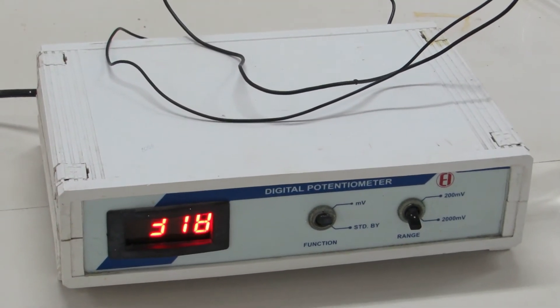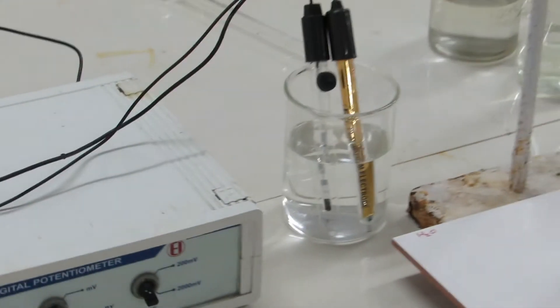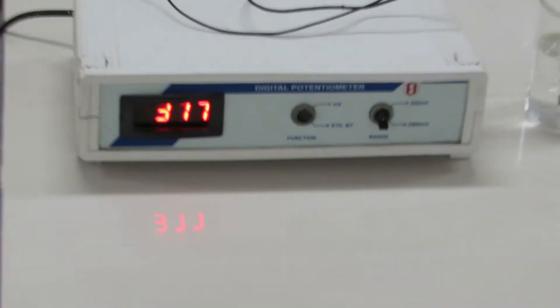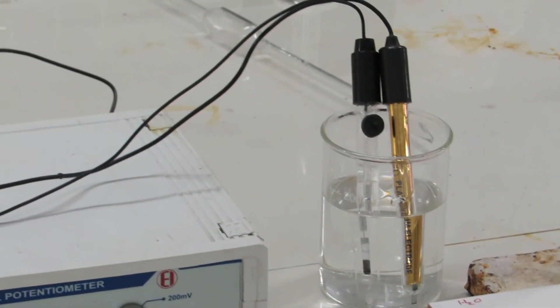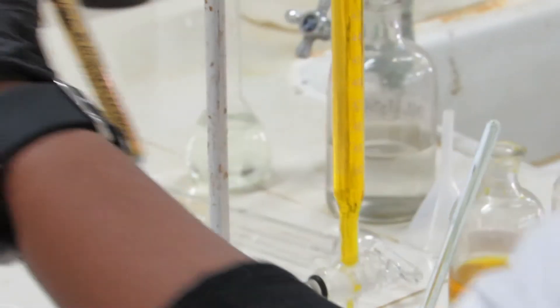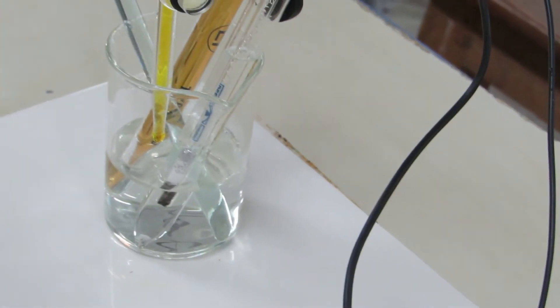Now the prepared iron solution and 20 mL of sulfuric acid are ready. This is the potentiometer — you have two electrodes: one is the measuring electrode and one is the calomel electrode, the standard calomel electrode (SCE). If you keep these two electrodes in the iron and sulfuric acid solution, it will give the potential of the iron Fe²⁺. It gives readings in millivolts. Without addition of potassium dichromate, it is giving around 301 mV.